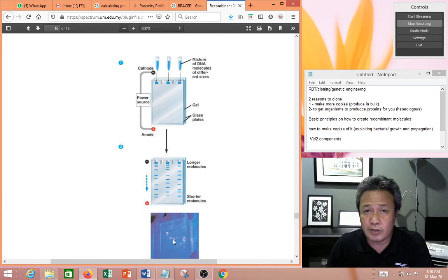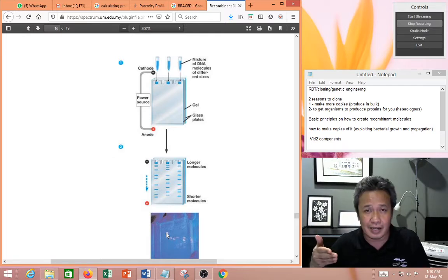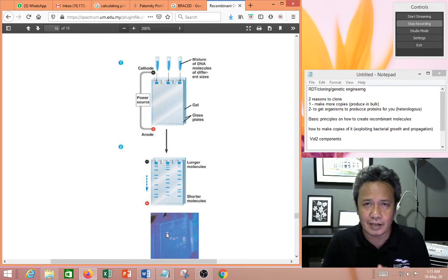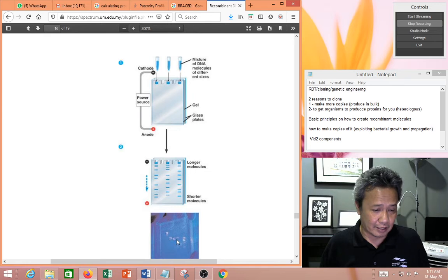How do you view your fragments? In this example, you dye your DNA with ethidium bromide. Ethidium bromide is a carcinogen. It can cause mutation if you're not careful, so normally when you stain your DNA, you wear protective gloves and so on. You mix this chemical with your DNA, and it will bind to your DNA. What ethidium bromide does is that it will fluoresce if you view it under UV light. So you can see here, you get a very pinkish color. These are your DNA.